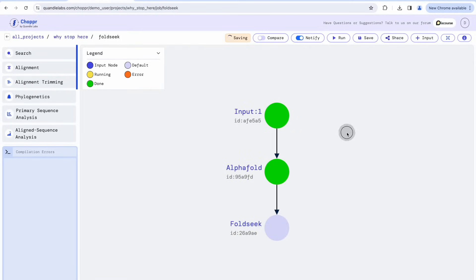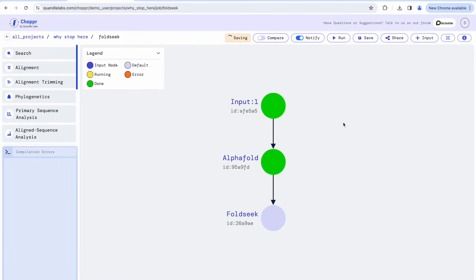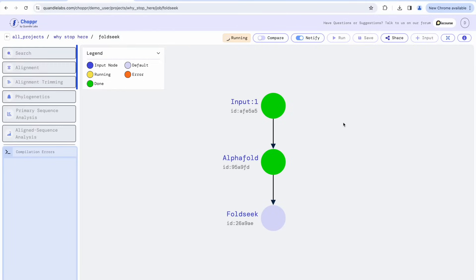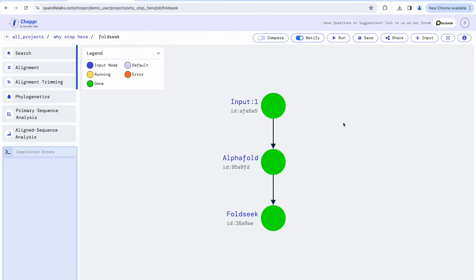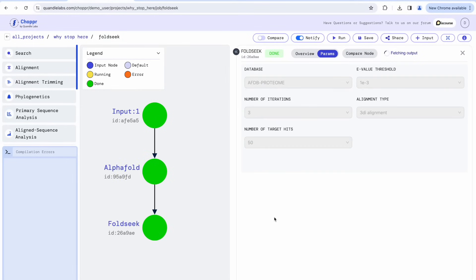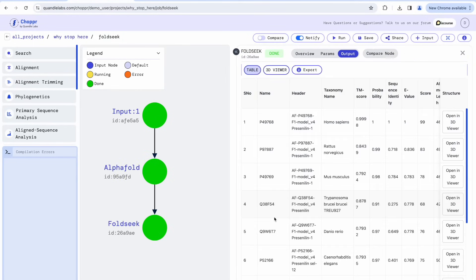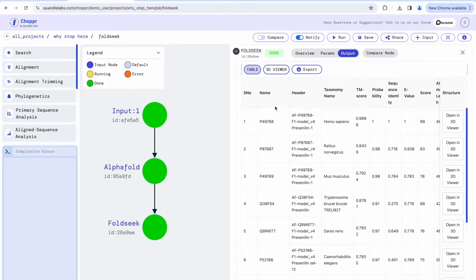By using Chopper, you can focus on interpreting the results and let us handle the computation. We present FoldSeq search results in a table that includes the taxonomy, e-value, and sequence identity, among others.